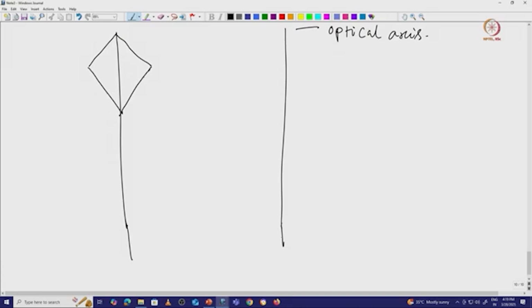If we are using some strong current, it can go something like that. Here we are not interested in whatever current, we are maintaining the lens current in such a way that some of the electrons will be blocked, from the black to blue, and some of the electrons will go.